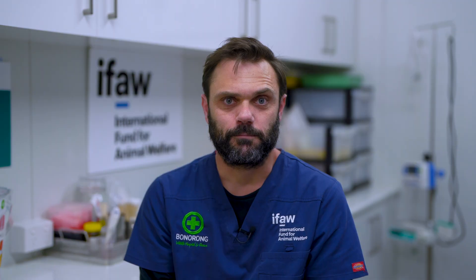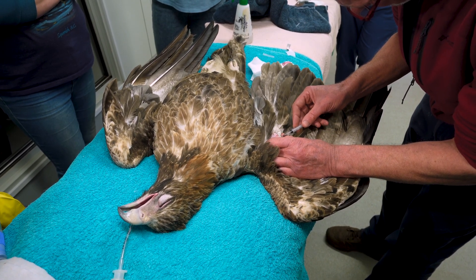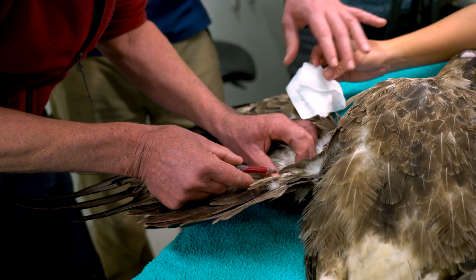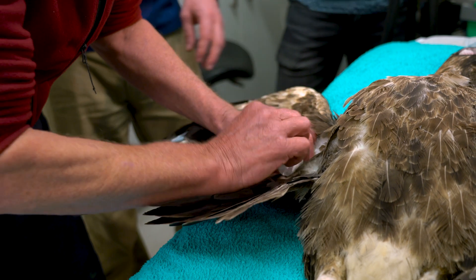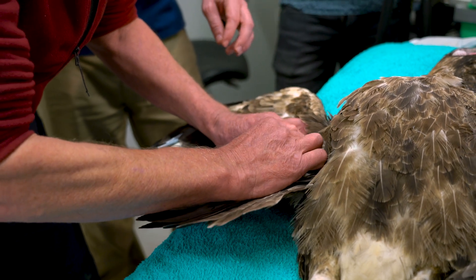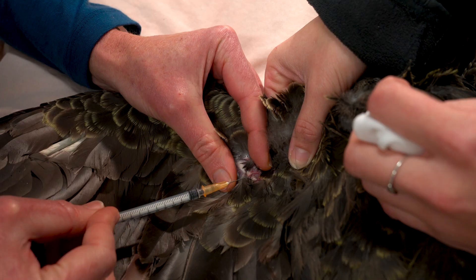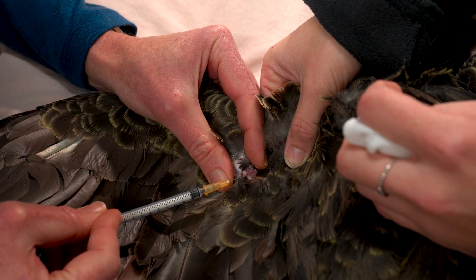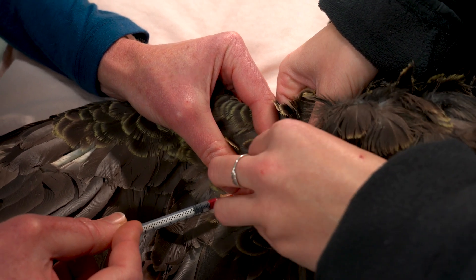For anything in between, I will use the ulnar vein, which is on the ventral aspect of the wing at the level of the elbow. I would use the ulnar vein in larger bird species if I need to collect a larger amount and the jugular is not as easily accessible. In larger birds I can collect an amount sufficient for biochemistry or hematology.